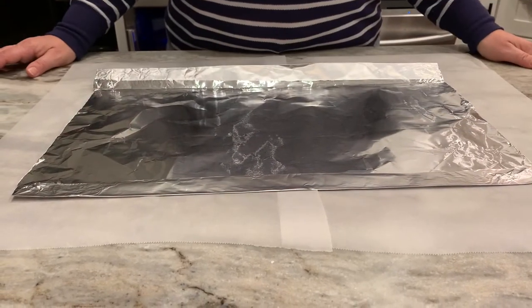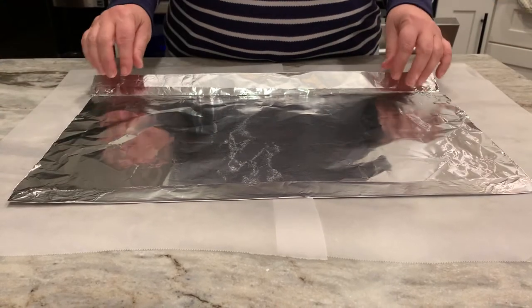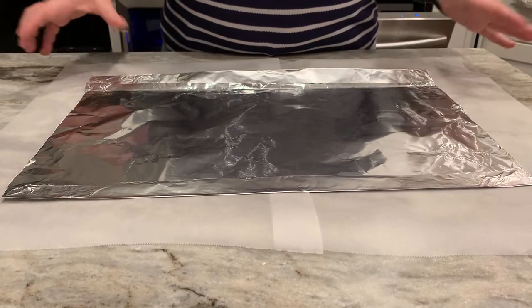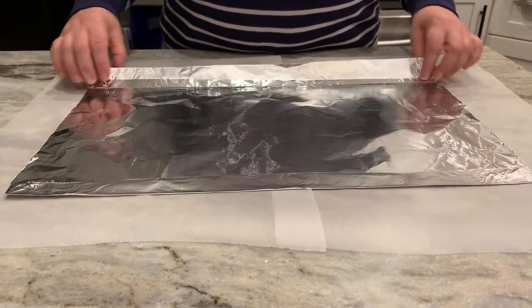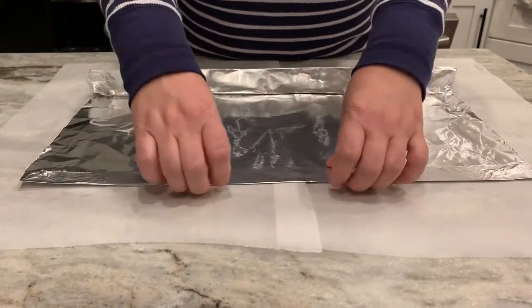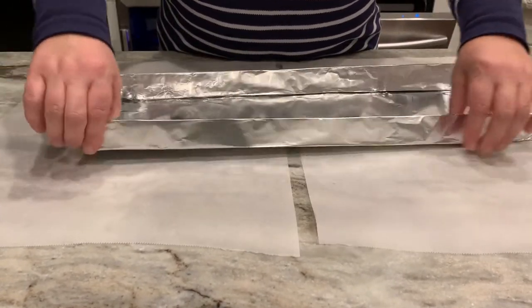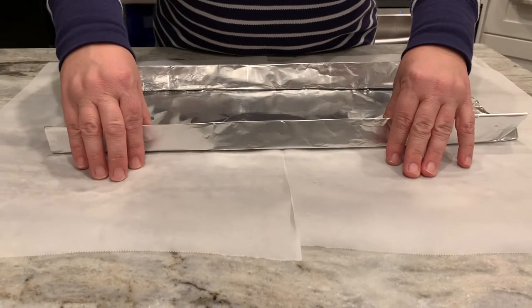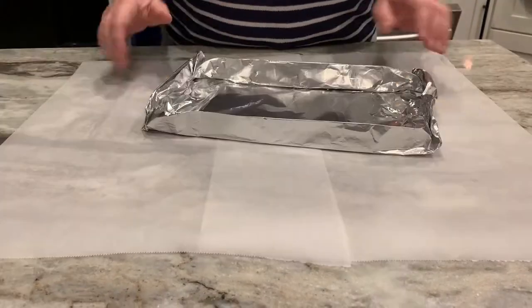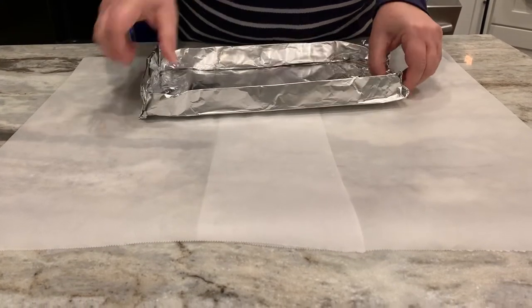We're going to do a chicken leg dissection. First, we can start by making a dissection tray — all you need is aluminum foil and some wax paper or a paper plate. Pull the sides of the aluminum foil to make it into a tray. Because we are working with raw meat, make sure you sanitize surfaces when you are done with the lab.